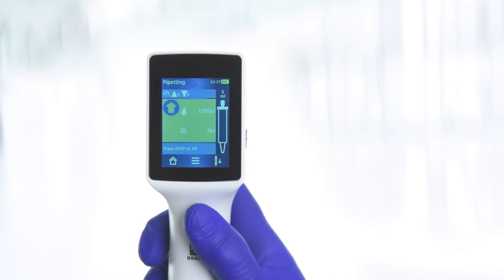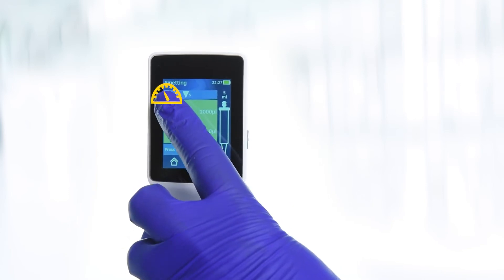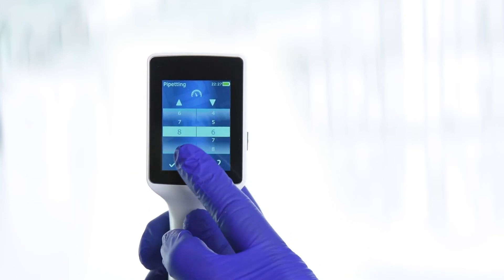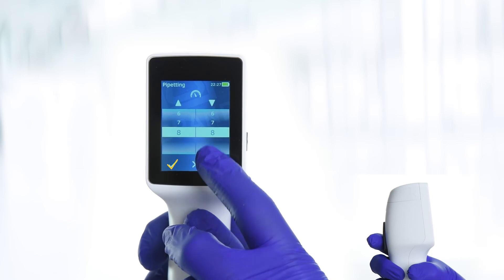To set the desired aspirating and dispensing speeds, tap the speedometer icon. Set the desired aspirating and dispensing speeds by swiping vertically up or down. Then tap to confirm.